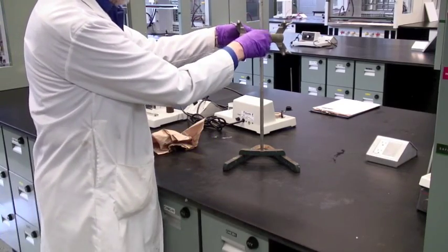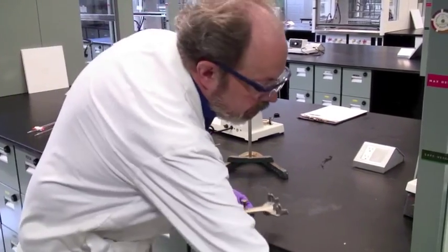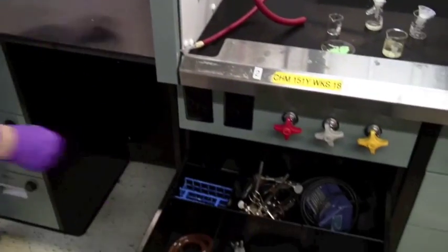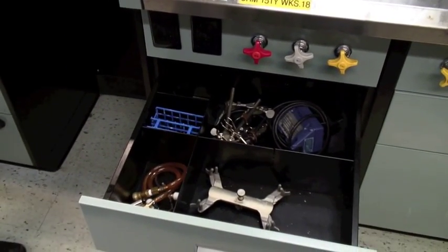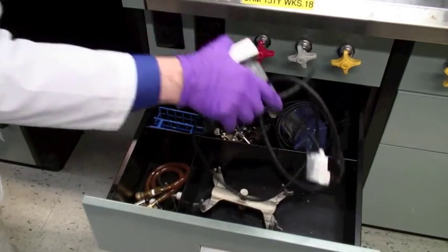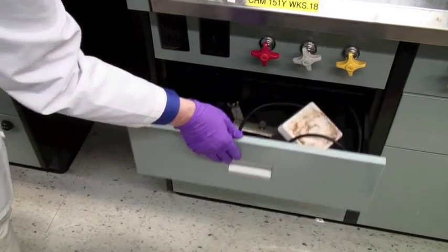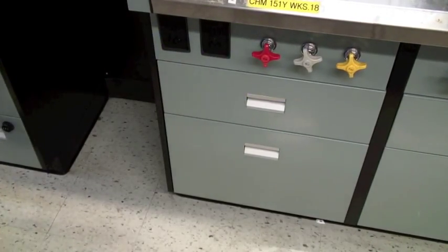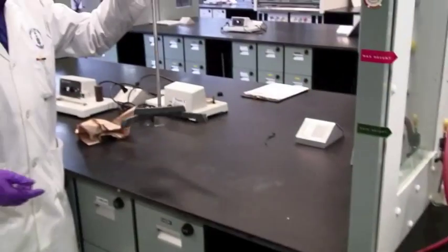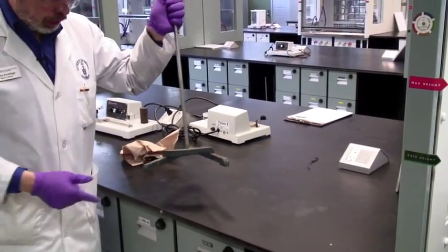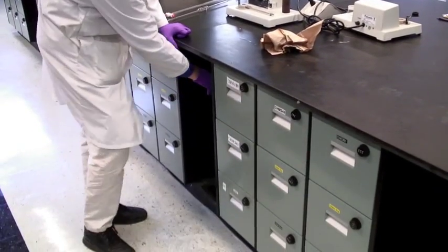The burette clamp, the butterfly clamp, goes into the drawer underneath along with any hot plate, and close that up because other people will be using that. The retort stand does not live here. It actually lives down here underneath.